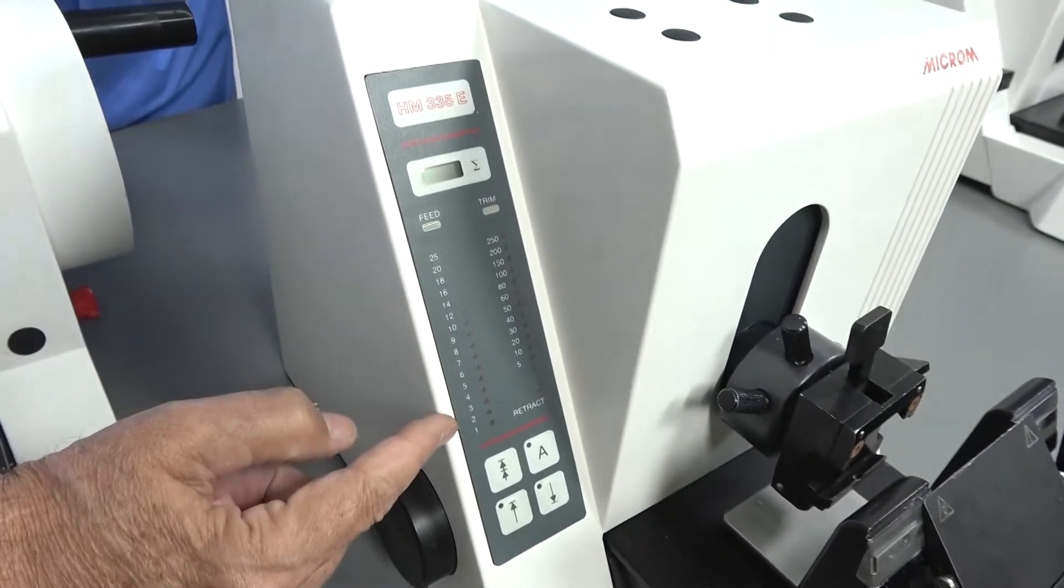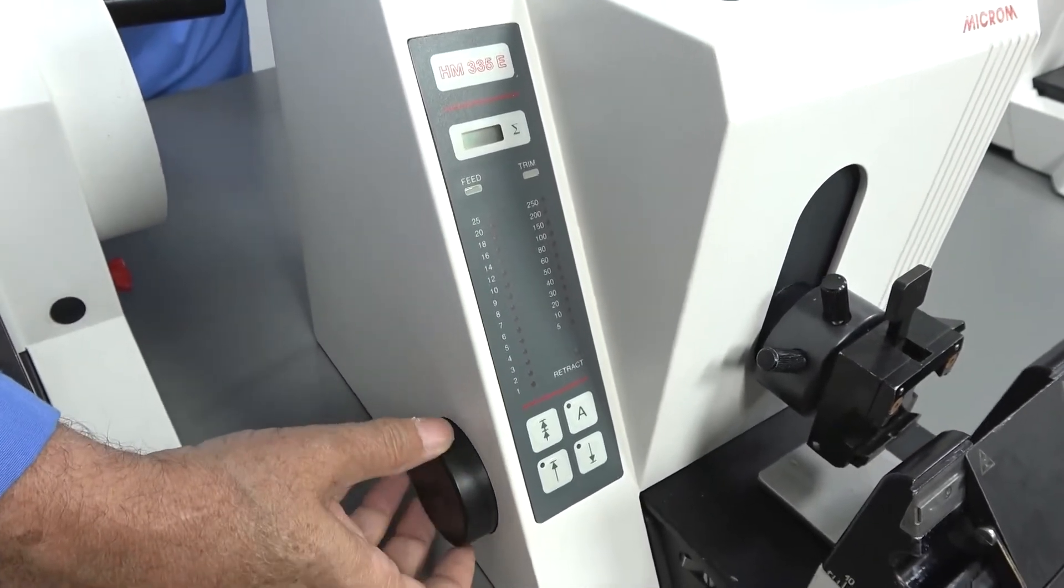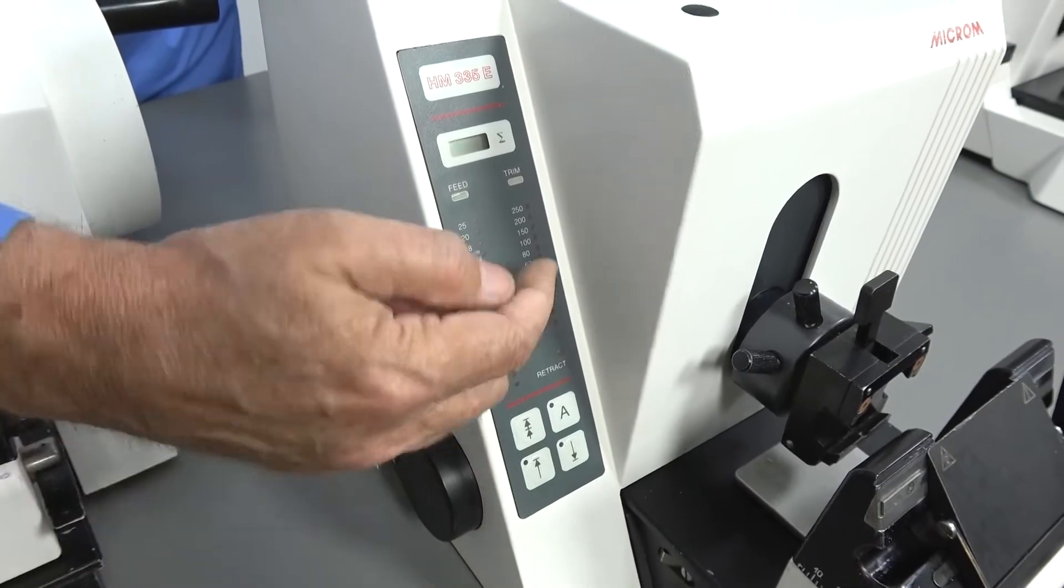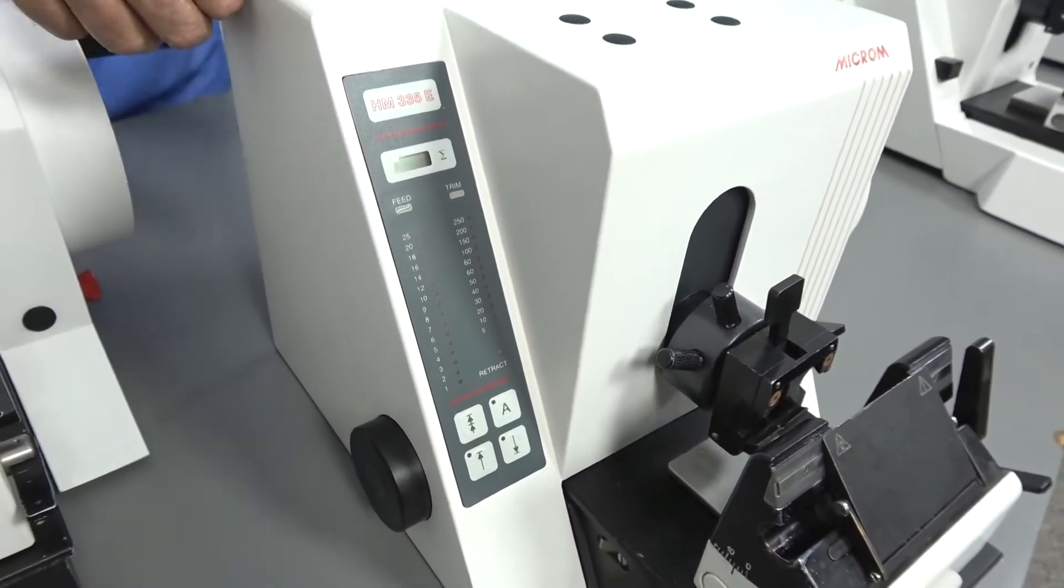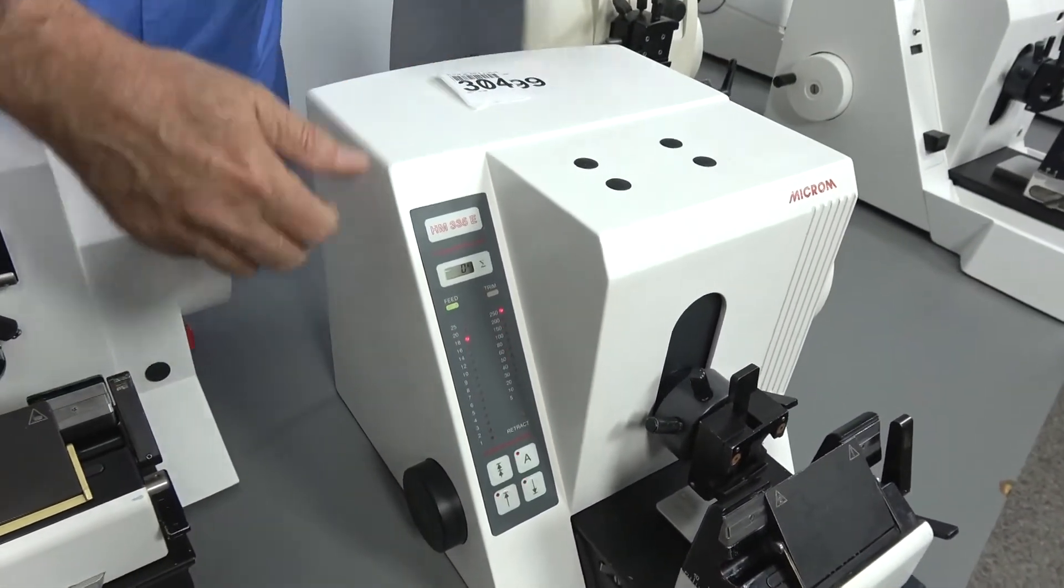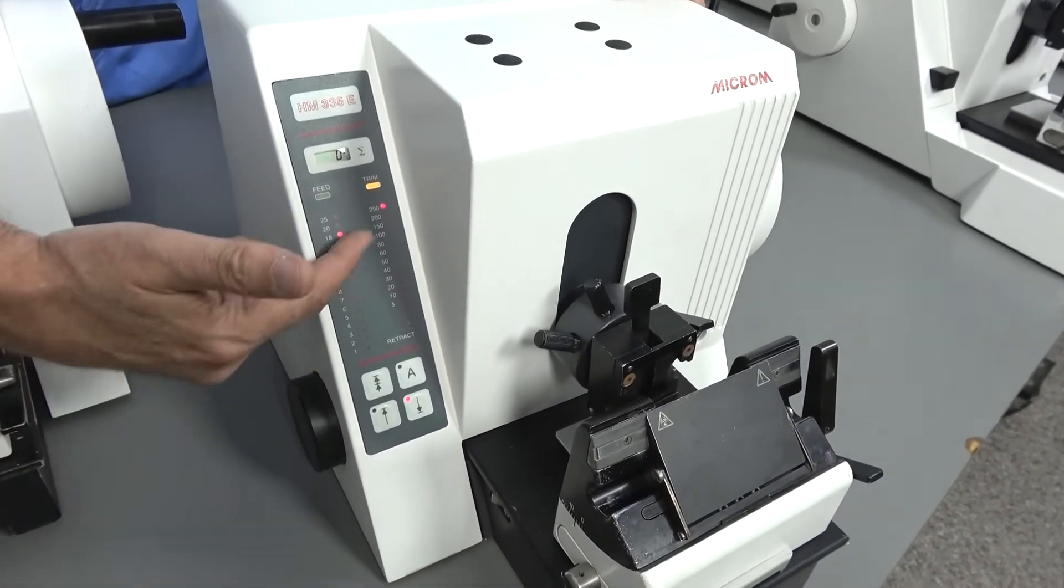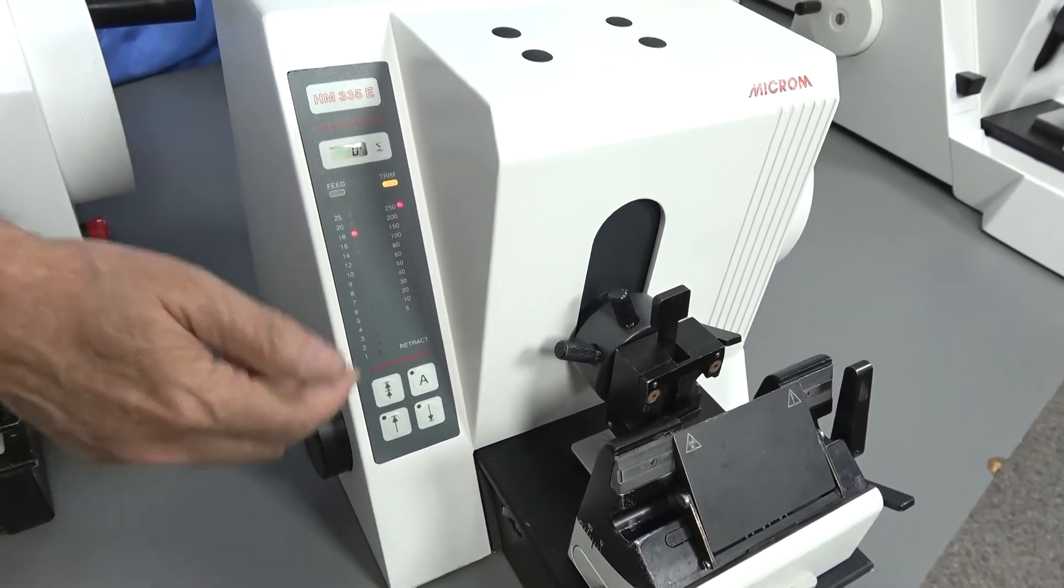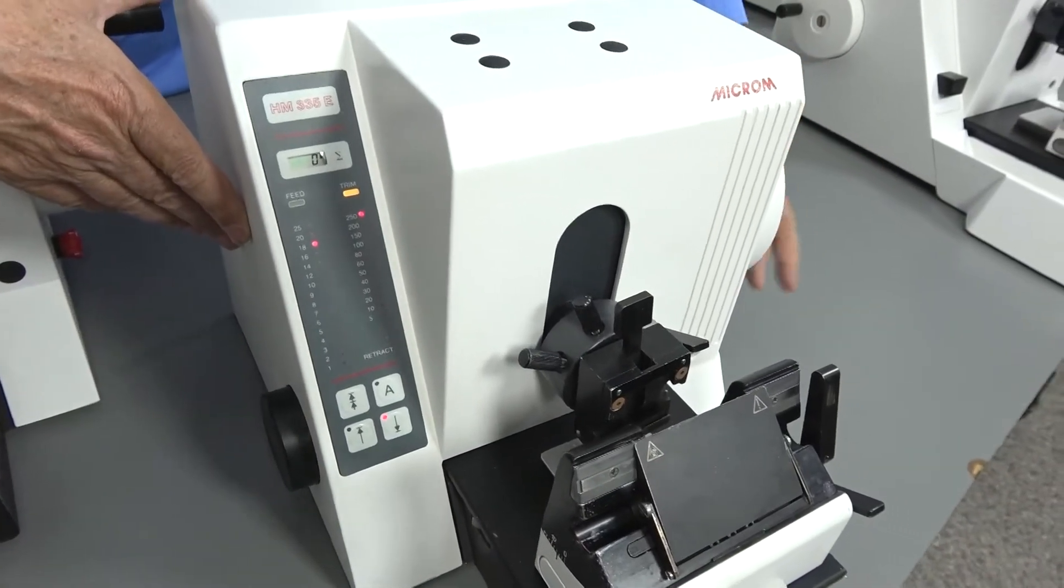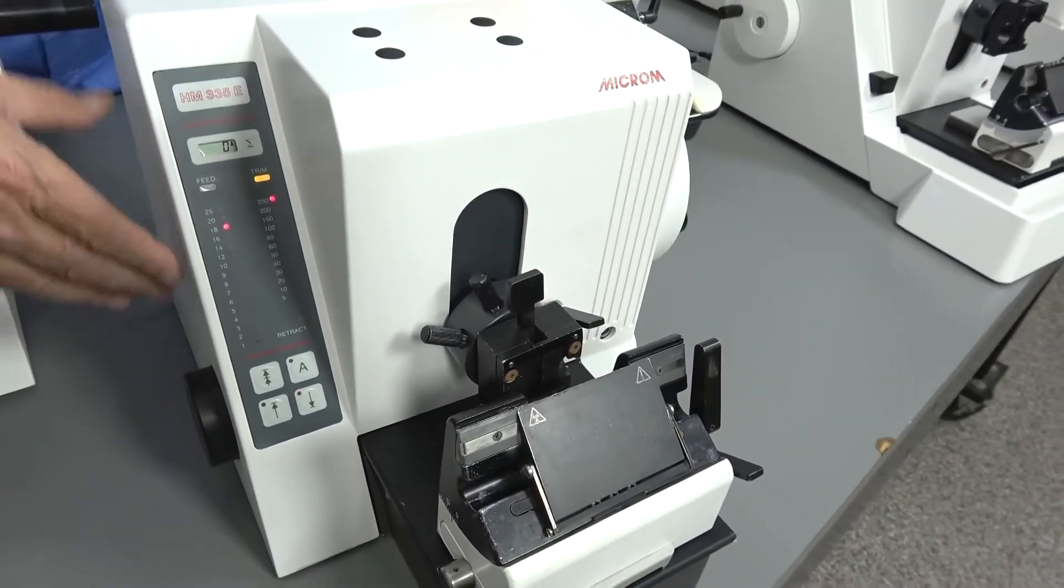It's digital here, so you can change your feed and trim, change to which menu you're going to be going on either side. And I've probably been pushing on the button and the system's not been on. So when you push your button, you change from your feed to your trim. When you turn the wheel, it's going to advance that amount.